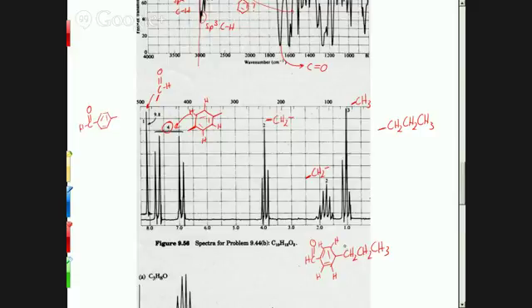Yeah, so that's where it goes without messing things up. We can put it here. See that? In between those two, make an ether type functional group. That doesn't mess up any splitting. Doesn't change any double bonds. Here, maybe we should stretch this out a little bit so we can see it. That's the only place we could really put it in.